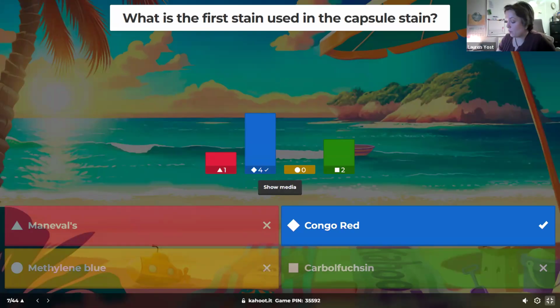So that's one you might want to put a little more detail for what a positive and what a negative looks like. So for endospore, I have organized structures that have greenish tint to them that are surrounded by red cells. For a negative endospore test, I'm putting only red cells. It should only be just red cells all over the place. There shouldn't be any defined structures around them. Only red cells if it's negative for the endospore stain. Okay? So this should hint to you that I have a tendency to put positive endospore on the exam. I just expect you to notice that this is the endospore stain.